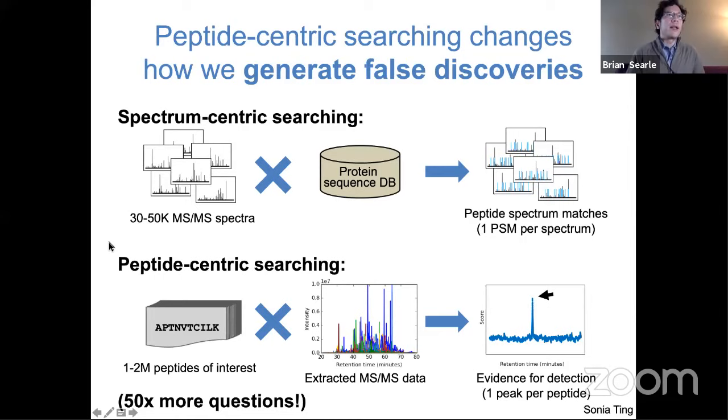And in terms of bias, in terms of hypothesis generation, that actually is kind of attributed to this question of library size. So for example, if you use a very small library, then you end up potentially biasing your ability to detect peptides. Obviously, you can't detect peptides that are outside of that library, for example.